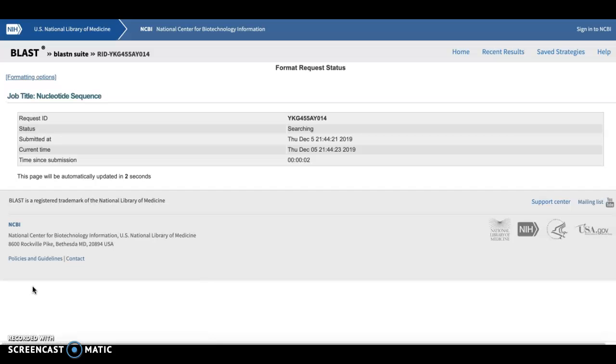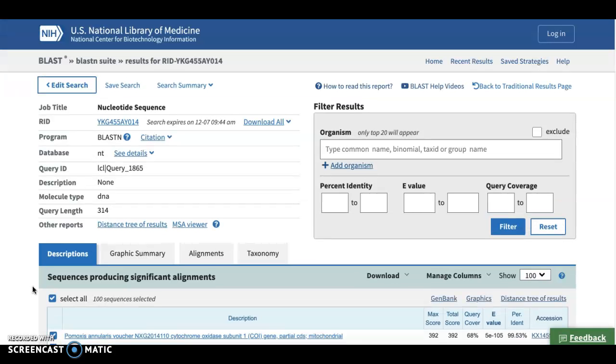It's going to take a few seconds, and what it's doing is aligning your DNA to what's in the database, the known gene sequences in the database. Depending on how good of a sequence you got, you should hopefully get some results. If we didn't get a lot of DNA, there may not be enough to sequence to match up. Just depends. But everybody did a really good job on it, got some really nice samples. Let's see what fish this is.